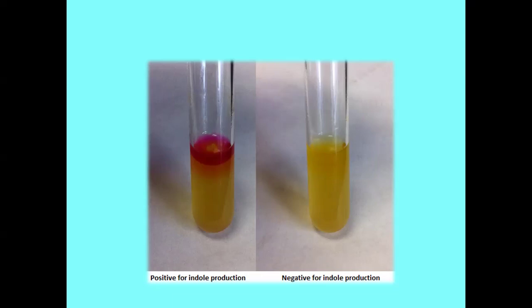That means the organism doesn't have the ability to produce an enzyme called tryptophanase, and we can say it is indole negative. So E. coli is one of the best examples of an indole positive organism. So we can identify it, but only one test won't be sufficient for confirmation. So we can go for other tests so that you can confirm whether it belongs to Escherichia coli or not.